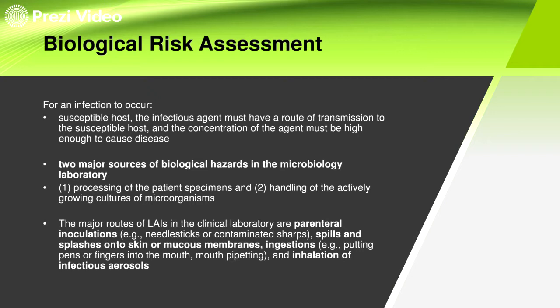And then, ingestion. Oh, by the way, sa spill kasi, for example, may natapon ka na solution sa laboratory na mayroong mga microbes. So, delikado siya kasi kapag natapon yan, lumilipad yung mga microorganism. You're actually creating aerosols. So, yung mga aerosols na yon, kapag hindi ka nakamask and then nasinghot mo siya, then pwede ka magkaroon ng infection. Okay? Also, in the ingestion, definitely, kapag kinain mo or meron kang nilagay sa bibig mo, that's why, whenever you are in the laboratory, strictly, you should not put anything in your mouth. So, no eating in the laboratory. Okay?